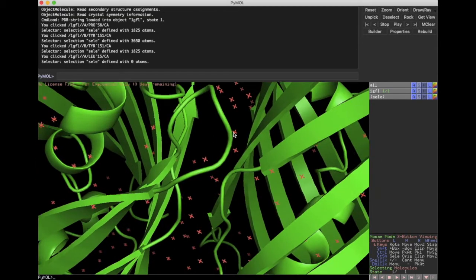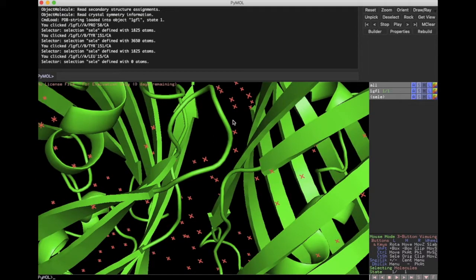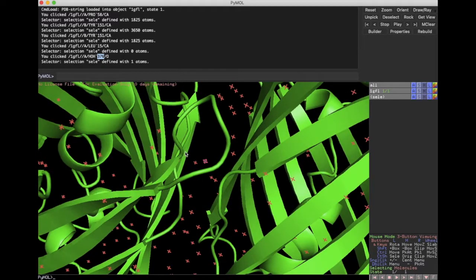If I zoom in and we look at these solvent molecules here, I can click on one of those and you'll see that I've selected molecule 376. Its composition is HOH, so that is two H's and an O, H2O, so that's water. So all of the solvents are water. I can again click on it and it will deselect, right?